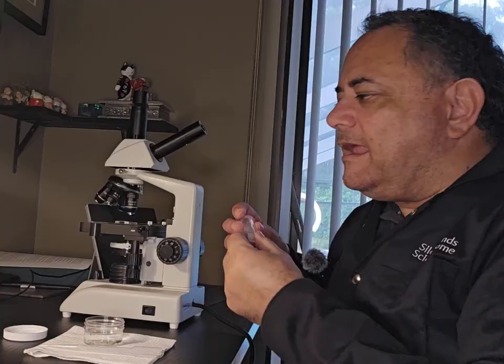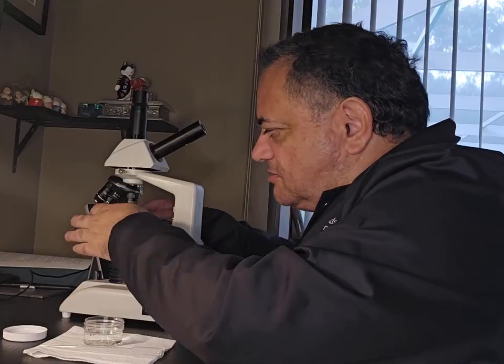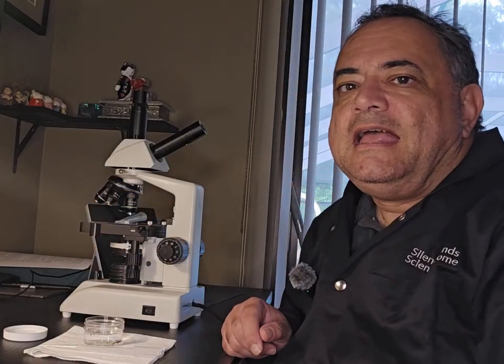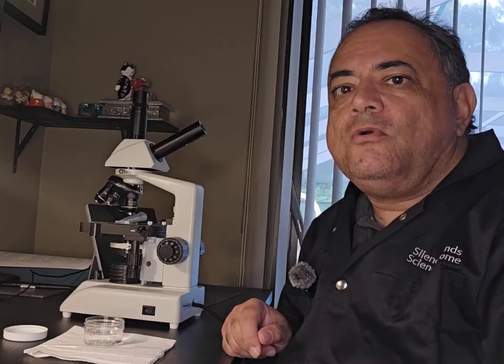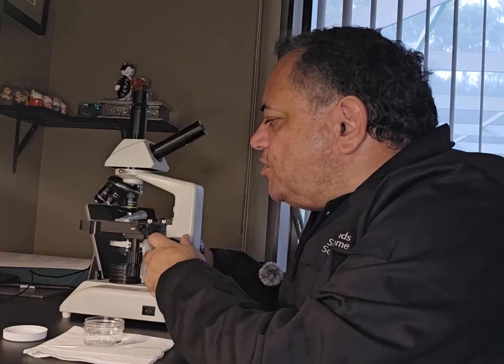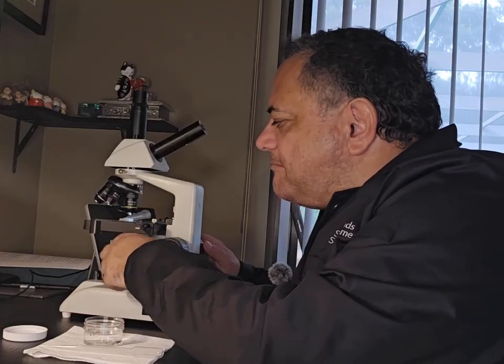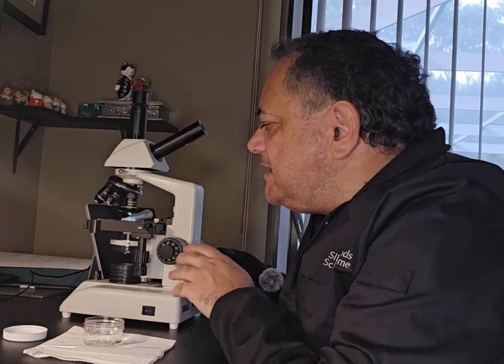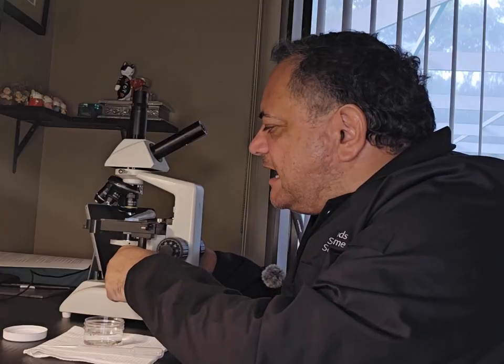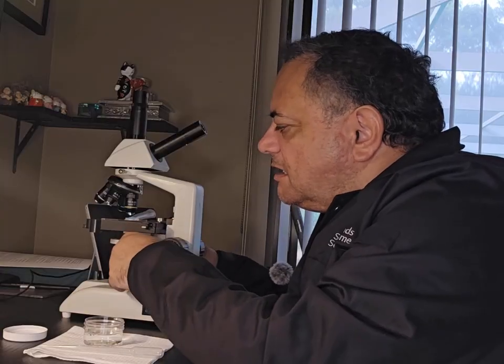Okay, and then I just fit this into the adapter on my microscope, and I can now view my tardigrades, or whatever I have in my demo slide. You can use microscope slides if that's what you want. That's fine.